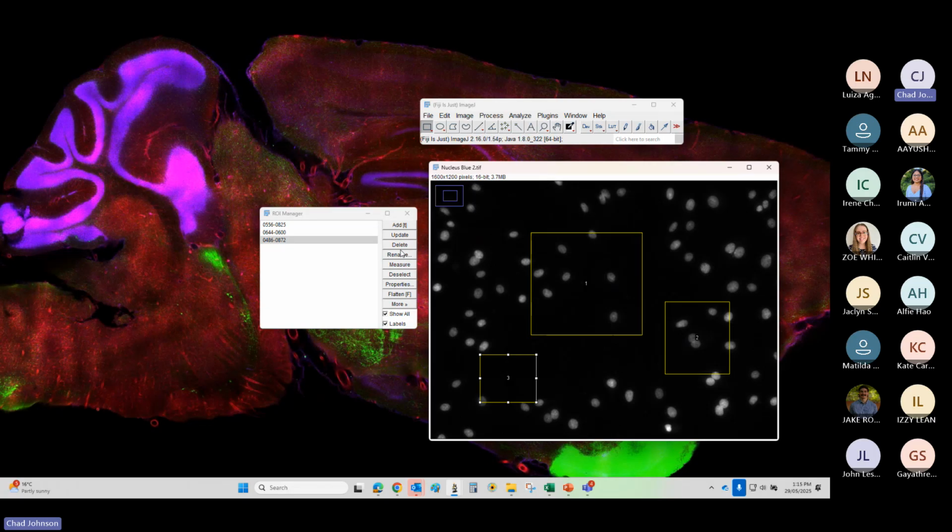So then I can click this and click update, and then those positions, because if you move it somewhere else and then select it again, it's actually okay, they've changed it. It automatically updates. It didn't used to do that, and there you go. So now it updates automatically. Oh no, it didn't. Okay, so there we go. Yeah, okay, so you do need to move it and then click update. And then that will be now in that new position.